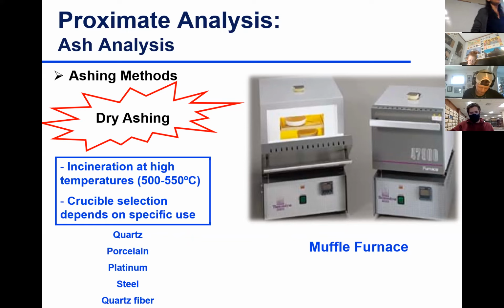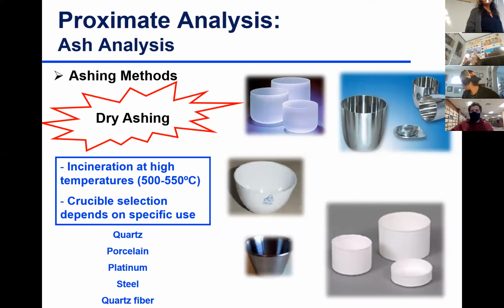Same with everything, you get to select different containers to do the ashing. The common one that you see usually in labs is the porcelain one.